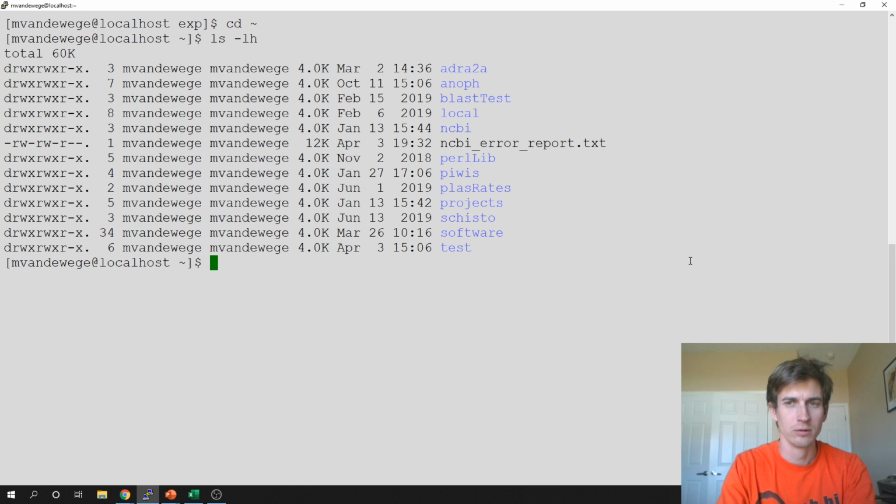All right, so last thing that I did, or what we talked about on Monday, or what I talked about on Monday, was largely about using Bowtie, or sorry, using RSEM as a mapper. So RSEM calculates expression, and it does so by using a mapper to map reads to these genes, and then basically counting how many reads actually map to each individual gene.